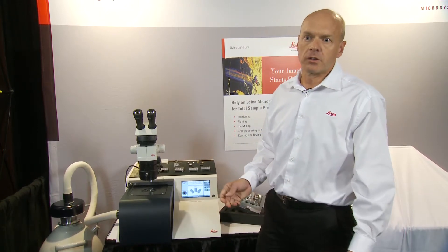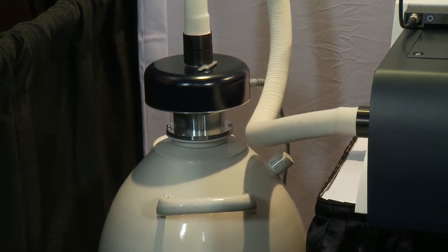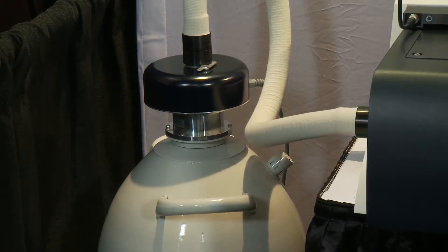For very delicate samples, we also have a cryo system here with a tank that holds 25 litres of liquid nitrogen, which is enough to process a sample for a full 24 hours.